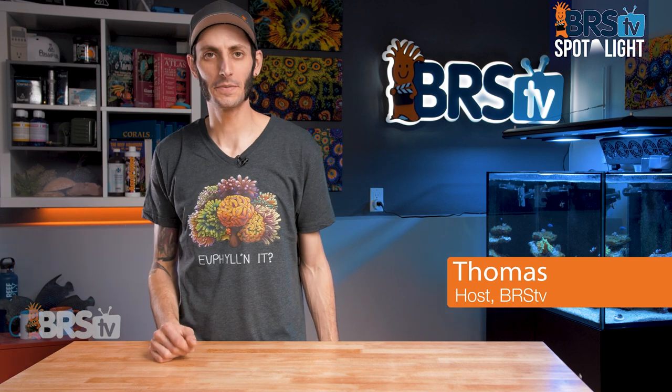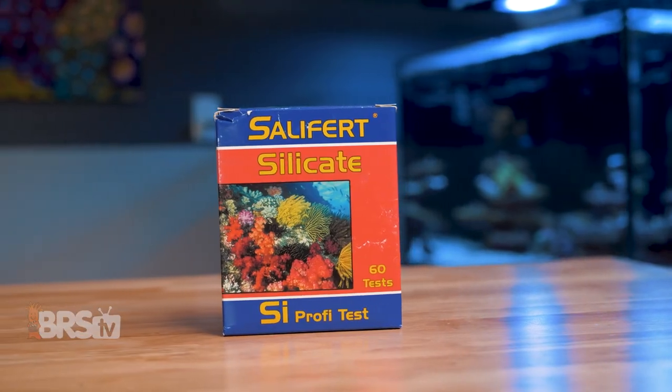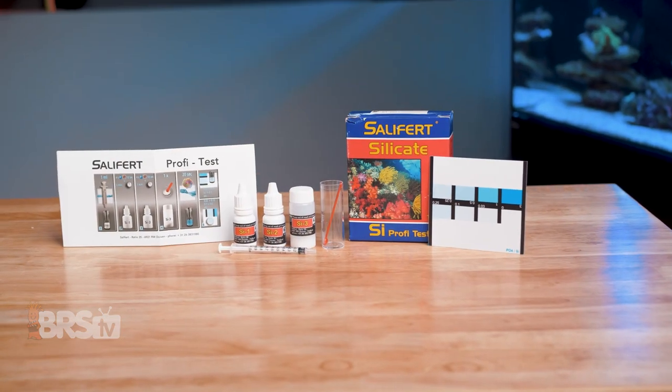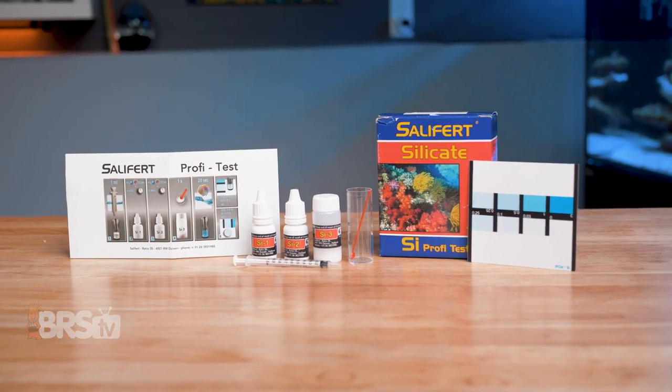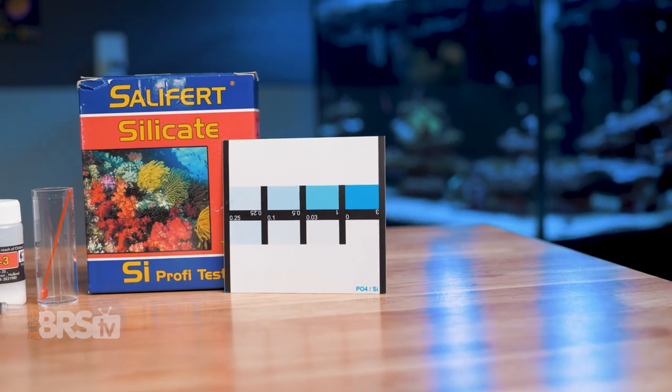Hey, it's Thomas here, and today we're gonna be checking out Salifert's Silica Test Kit. In this video, I'm gonna touch on why you'd wanna test for silica in your reef tank, what's included in the kit, and I'll walk you through how to perform this simple and affordable test.